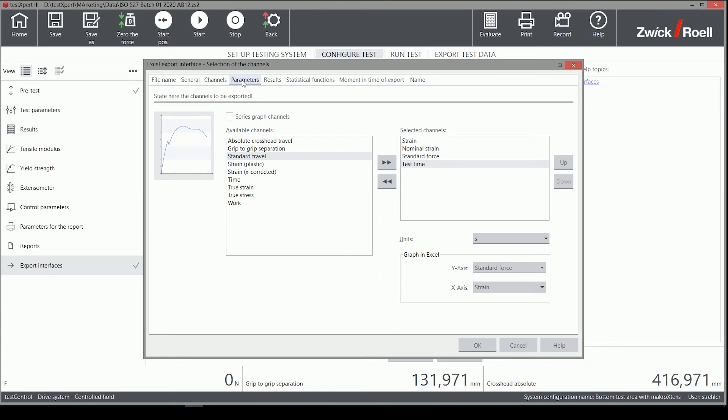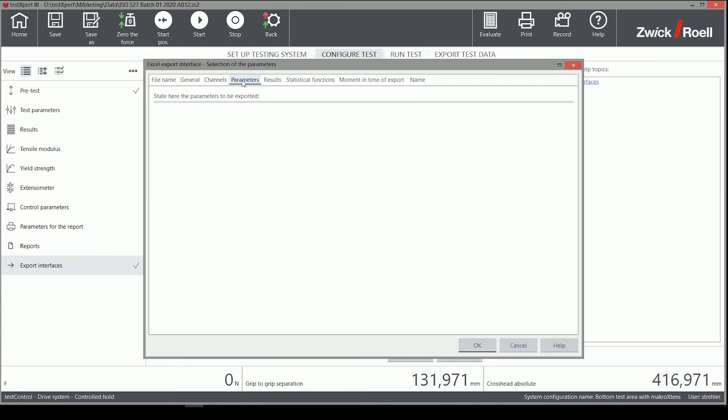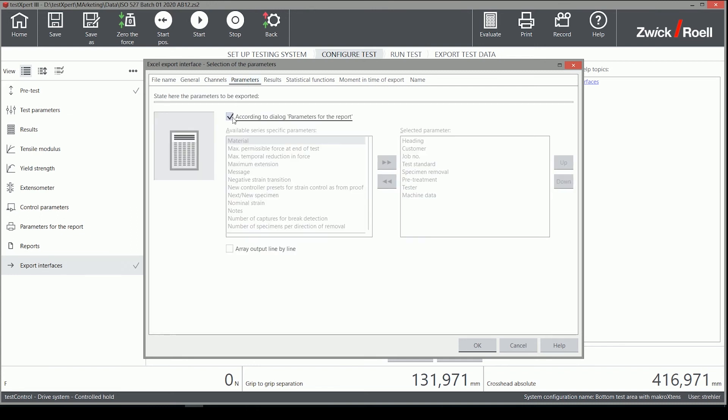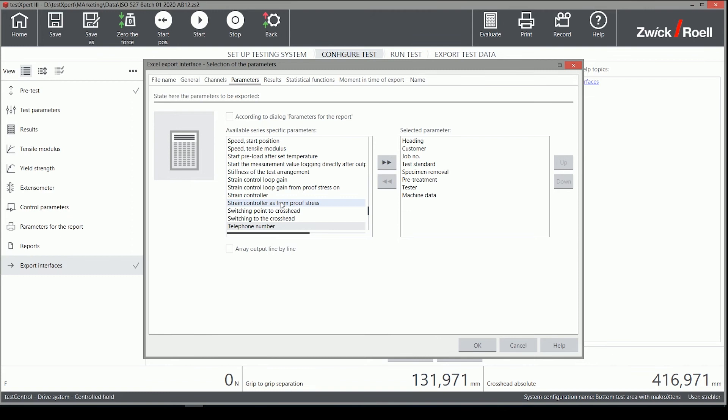Similar settings are available on the Parameters and Results tab. There are default selections made which can be adjusted.